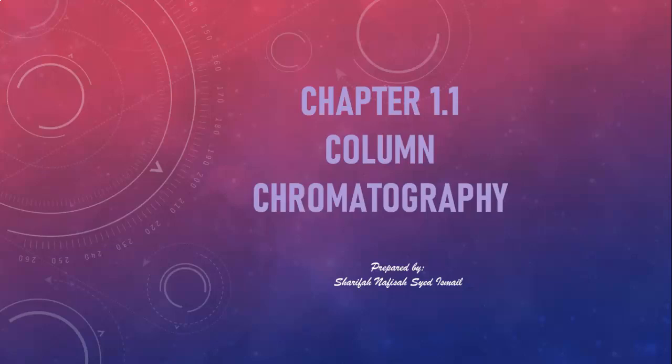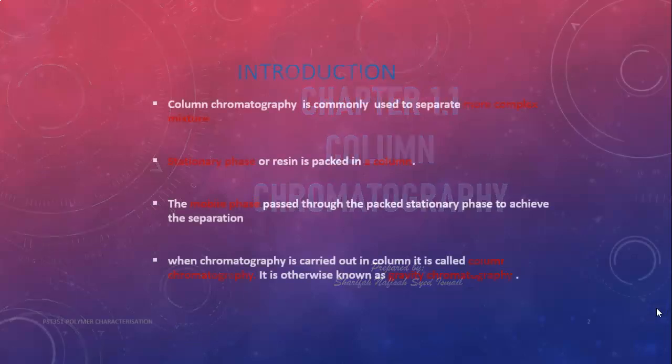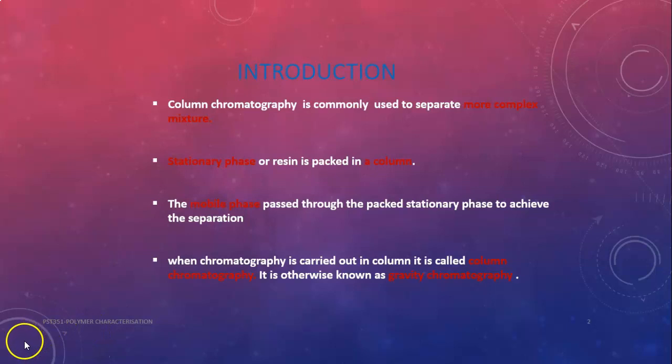For today's lecture, we will cover chapter 1.1, which is column chromatography. Okay, let's look at the first slide.